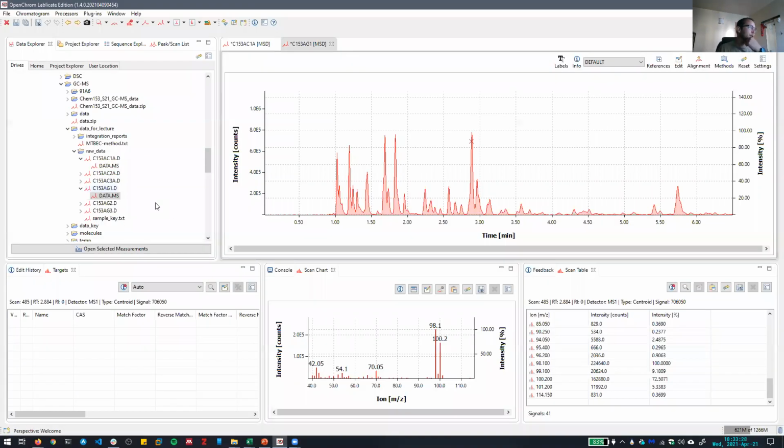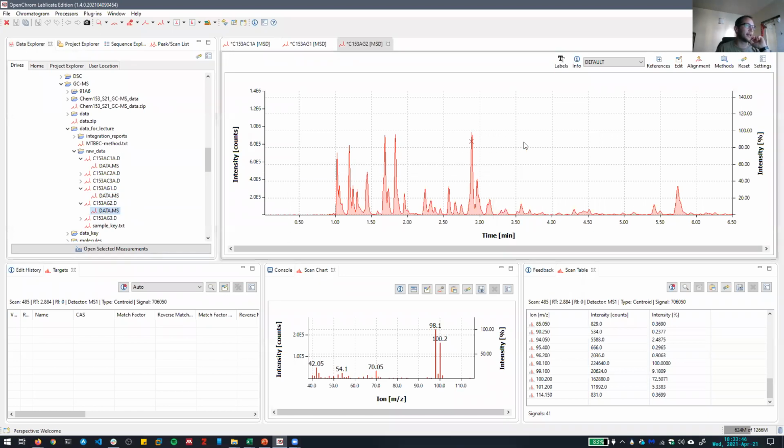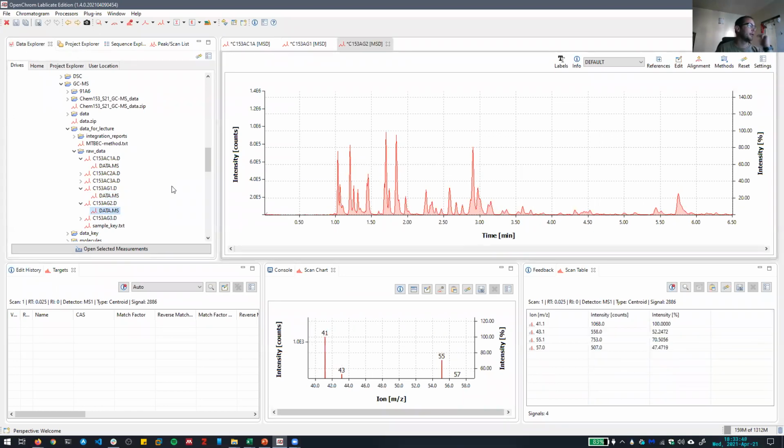The data that I gave you guys in here are just for your benefit to make some example plots, but the data from this are not the same ones that are in the integration report. The data from the report are just simulated so that you guys can get some good results. But these are just examples of what gas chromatograms look like for raw gasoline.